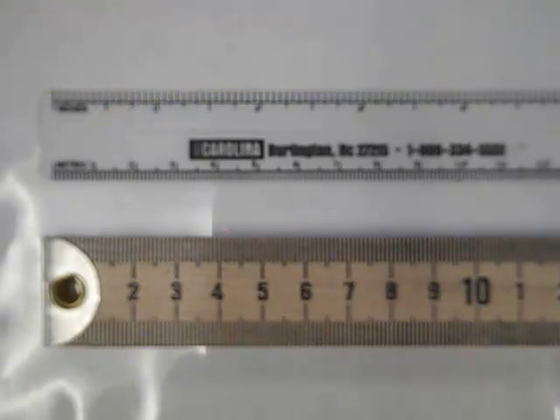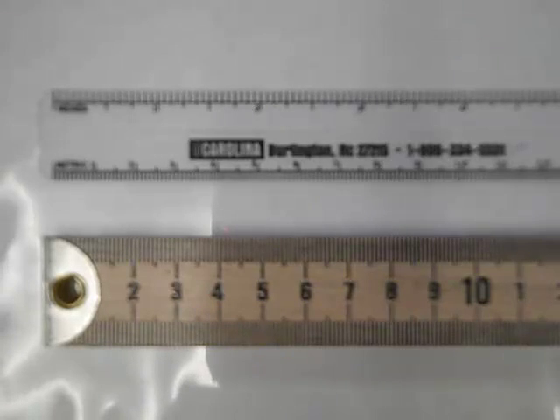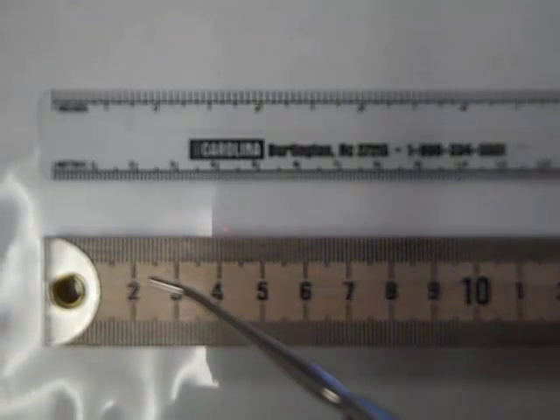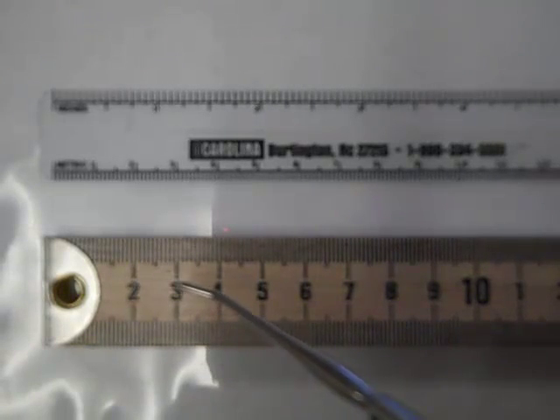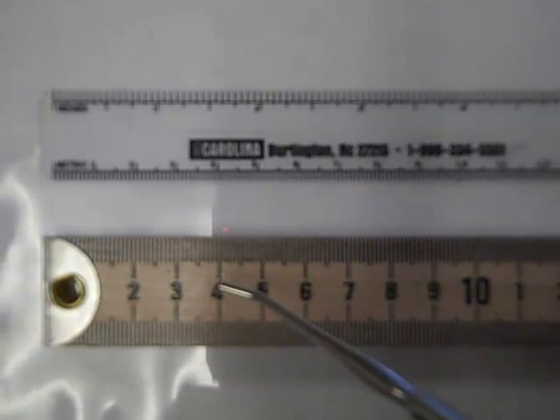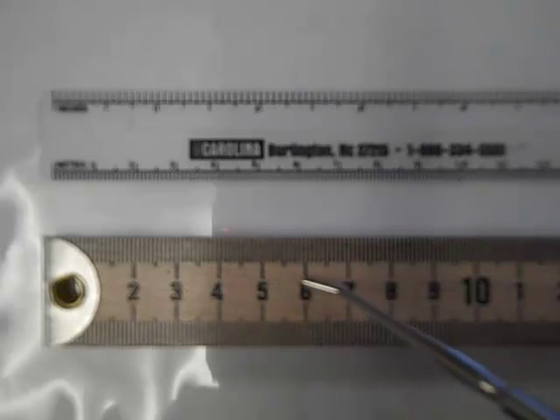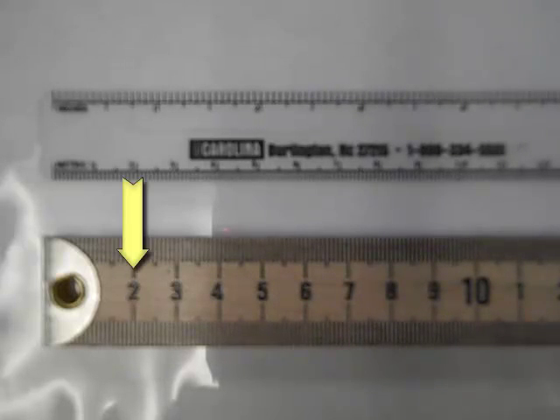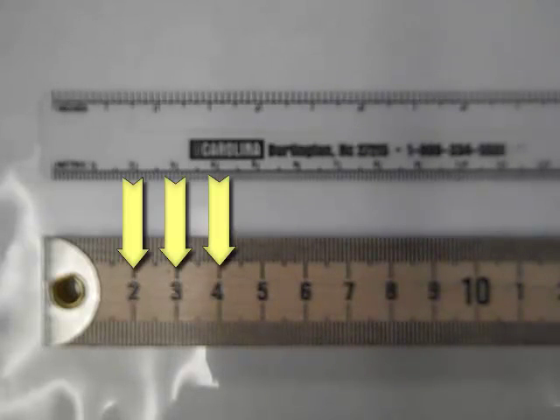What we see on both of these rulers and on the larger ruler, we see the numbers 2, 3, 4, 5, 6, etc. Those are the centimeters.